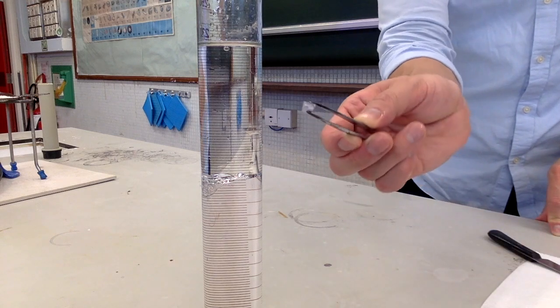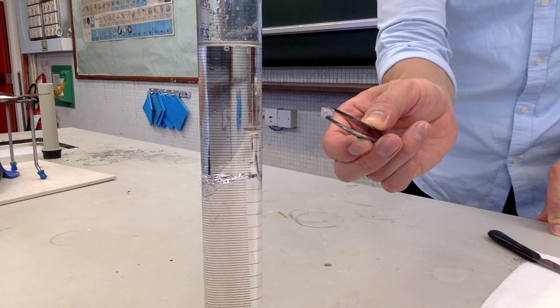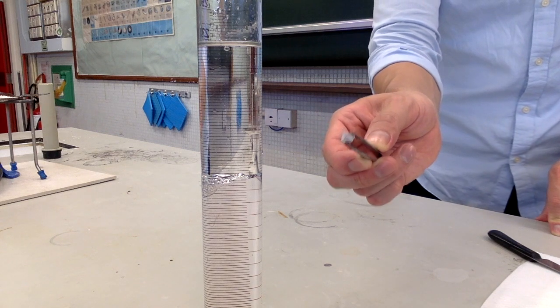Now, we are going to add these small pieces of sodium metal from the top. And let's observe.